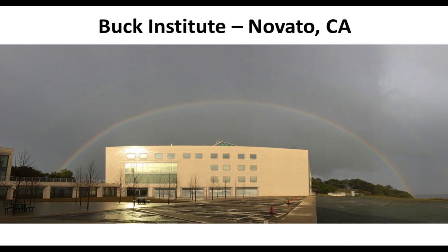Having this combination of a smart workflow and sample preparation that's highly reproducible with an interesting biological question, and then, as I mentioned, the appropriate mass spec scan type, I think that can really help the biology collaborator get the most out of their precious biological material and gain biological insights, which is the ultimate goal of the experiment.